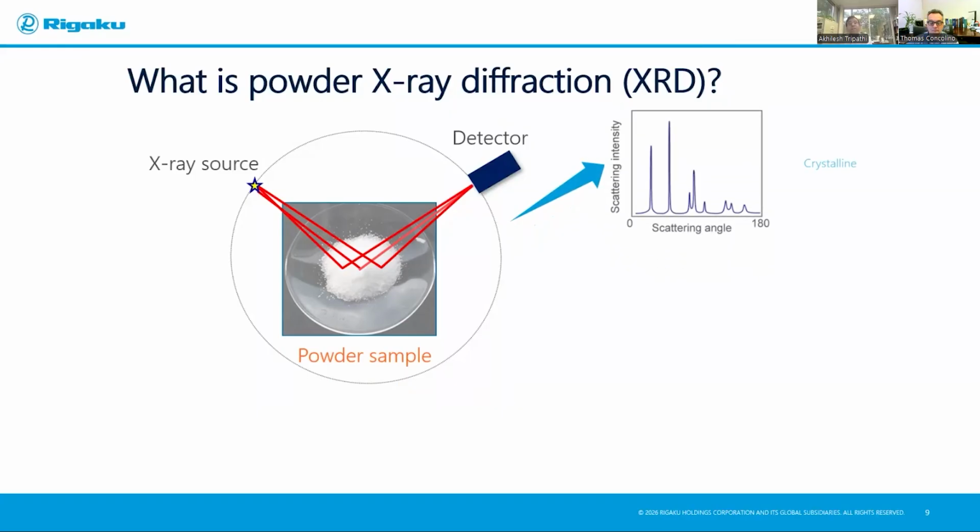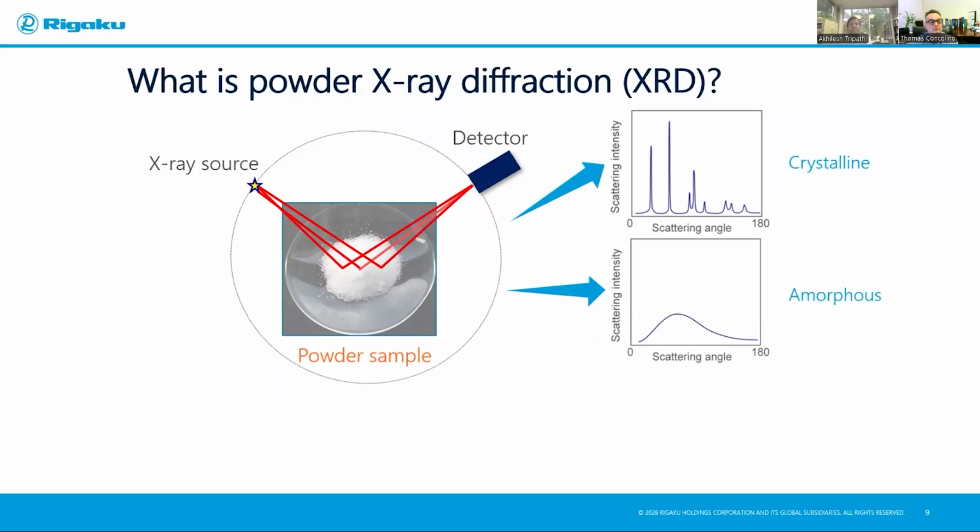You may also get, if your material is amorphous, an amorphous hump, usually called hump, around 22 degrees, such as the one shown here. Or you can get a mix of crystalline plus amorphous, sometimes also known as a mesophase, which is an intermediate state between crystalline and amorphous form, exhibiting properties of both.